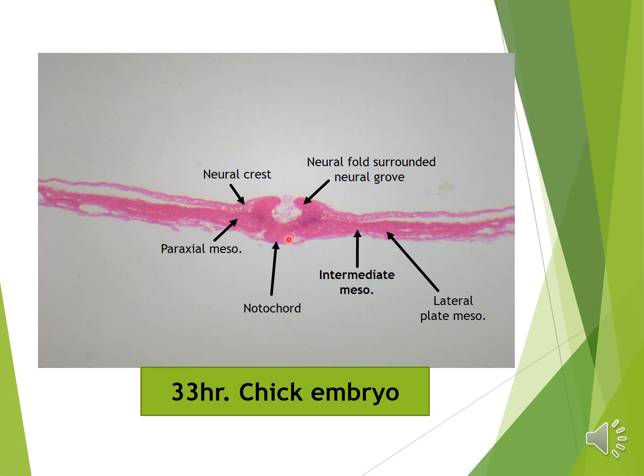Also in these sections, the cells at the tip of the neural fold, on this side and on that side, are the neural crest cells.